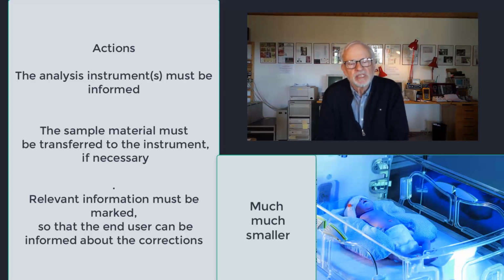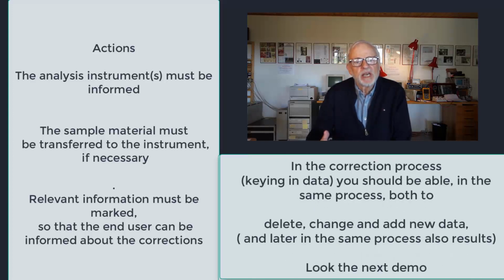So it is in this slide you have to see the next demonstration on the system. The user can on the form see which analysis has been ordered, if there is any result already, and thus the user can get an idea of where the sample is, if the user has to go to the lab and find it.